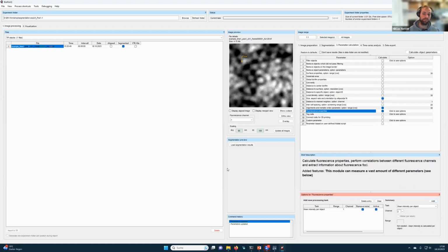And then if you plot them, you can see which objects have intensity in both of these channels high, or intensity where only GFP is present, or no mRuby, or both is present, or only mRuby is present, no GFP. Does this answer your question, or are you interested also in subcellular localization? I think you are not. Okay, any more questions?